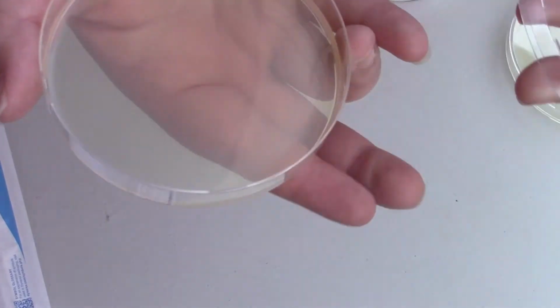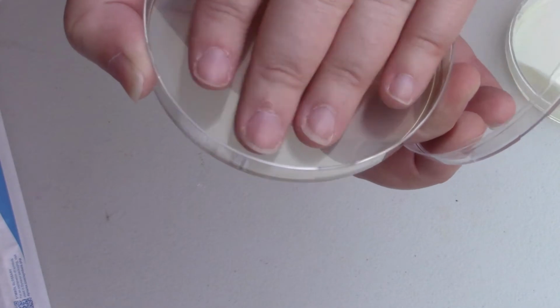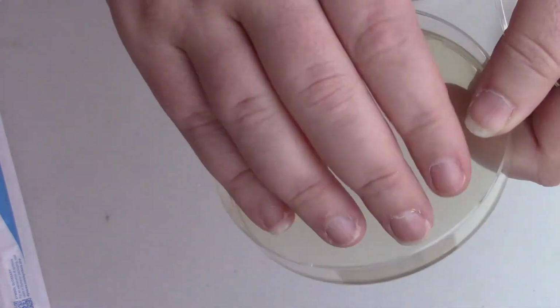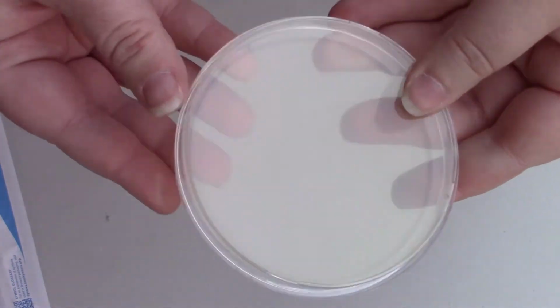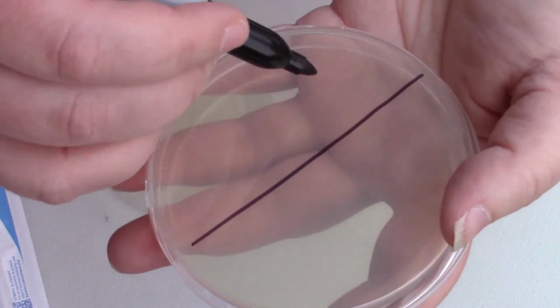So first we are going to start out with our fingers. So this is going to be our dirty control. Now, I don't remember when I had washed my hands before filming this, at least after I had last been in the bathroom. It's not like they were filthy, they look clean. So you put on the lid and then you turn it upside down. That's how you are supposed to store these.